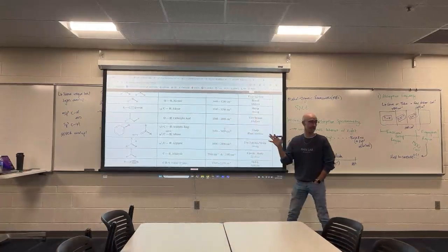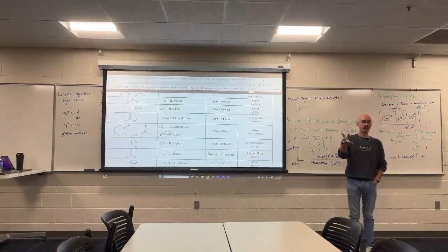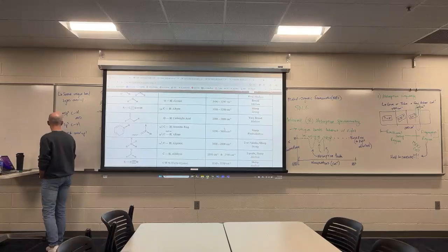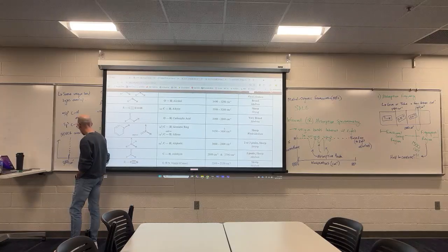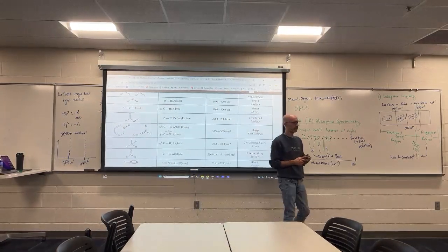That's really nice. It actually means that on the IR spectra that I give you, I can make two really nice lines. I will always provide these lines. I will draw a dotted line right at 3,000 wave numbers, and a dotted line right at 1,500 wave numbers. What is so useful about 3,000 wave numbers?